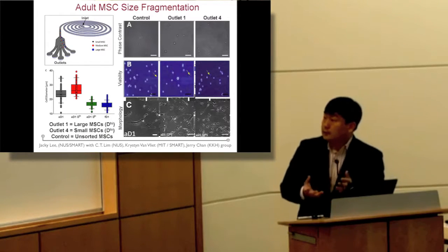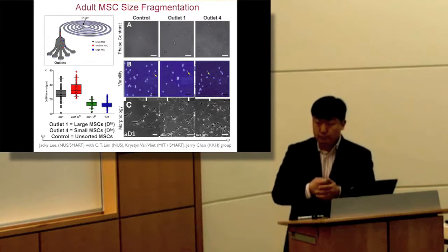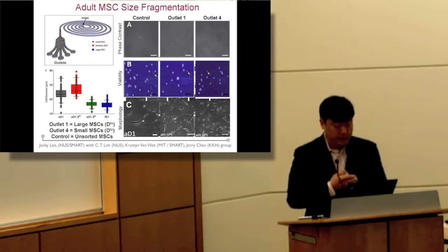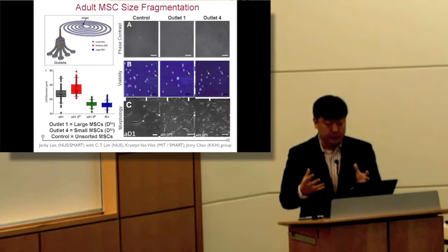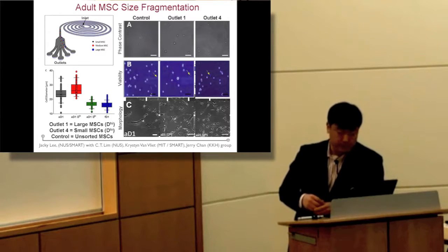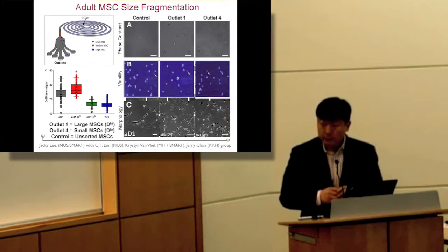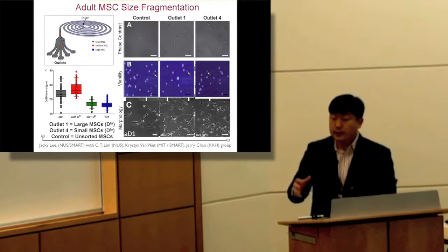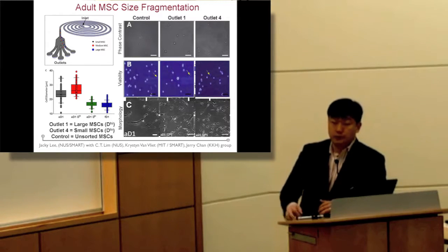Now, I'd like to show another example of using this type of device, because this device is really a nice sample preparation for any kind of biofluid. In this case, we are taking bone marrow aspirate or a mesenchymal stem cell sample, which is known to be very complicated and diverse. Starting from large volumes of such fluid, we try to select the cells that are smaller in size, and a number of publications suggest that those smaller MSCs are indeed stemmier, in the sense that they have higher differentiation potential.